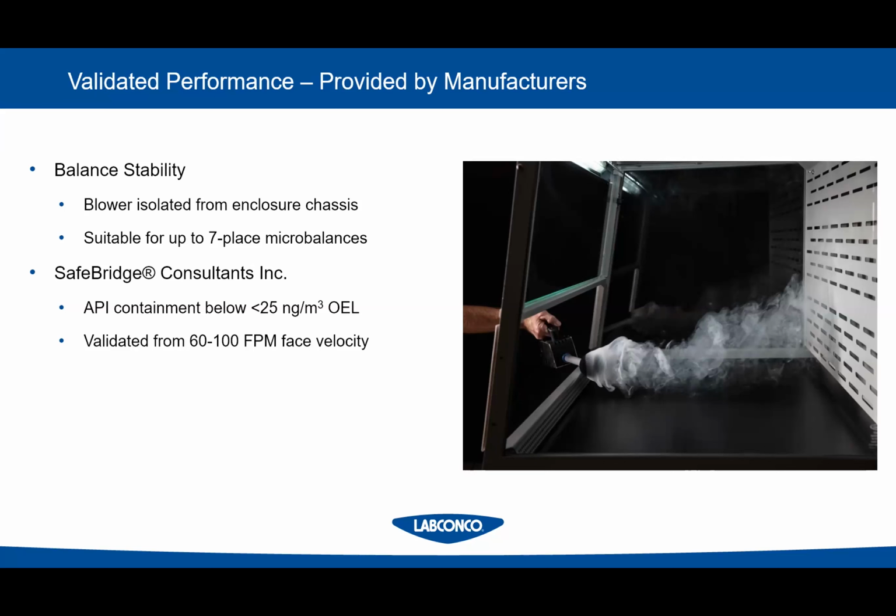So look for that on your enclosures, see what kind of containment they have. If you have a certain super toxic drug, you might need to move to a glove box. Like this might not be enough for you.